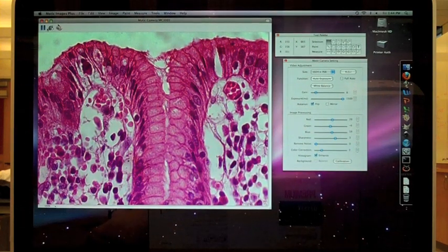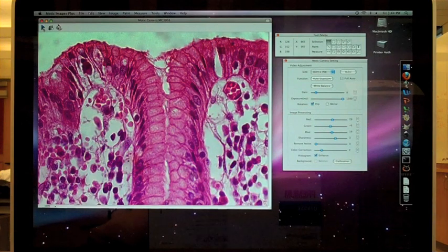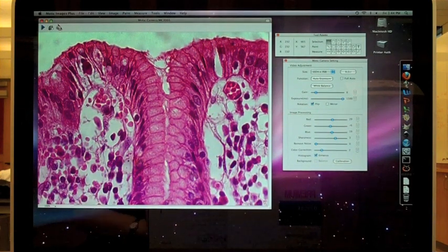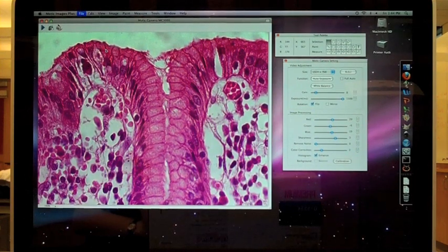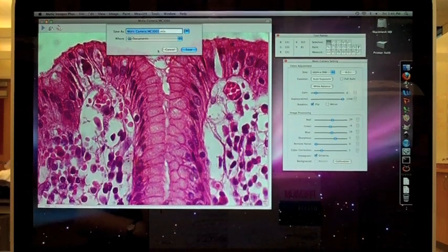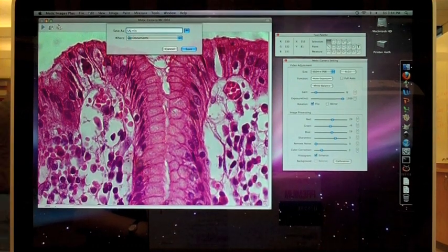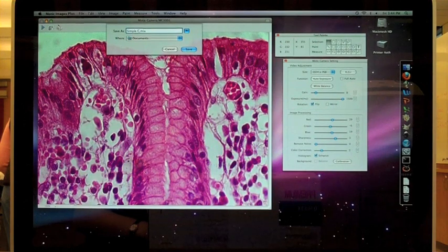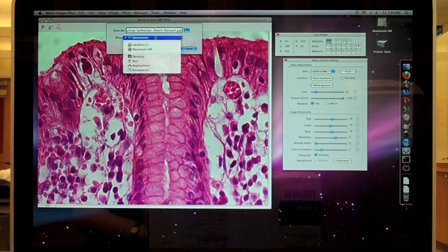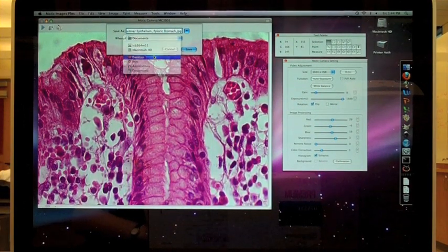Once you've finalized your image, hit the Pause button on the left hand side. This will prevent you from losing the image on the stage. Now click File, Save As. Rename the image according to the features on the slide or tissue type. Be sure to change the .mix extension to a .jpg. Be sure to save the file onto the desktop so that it's easier to access later.